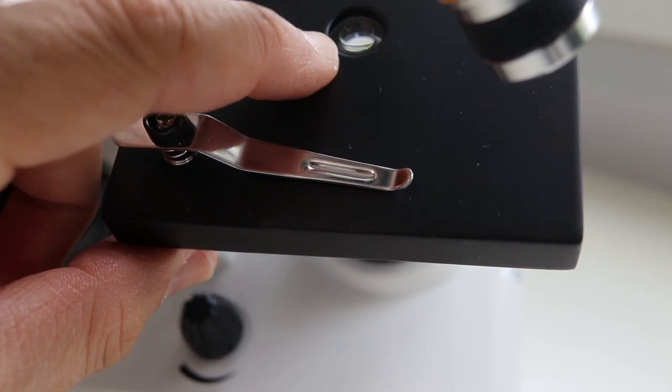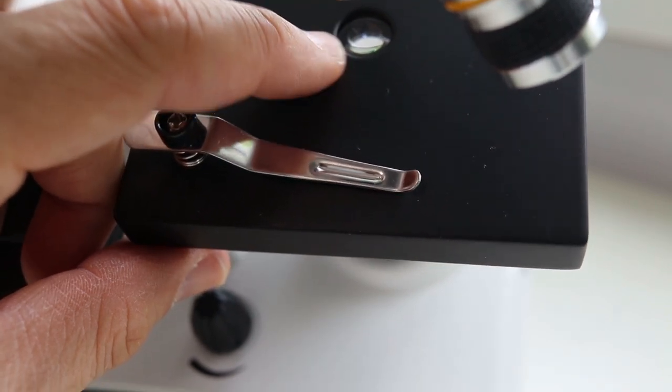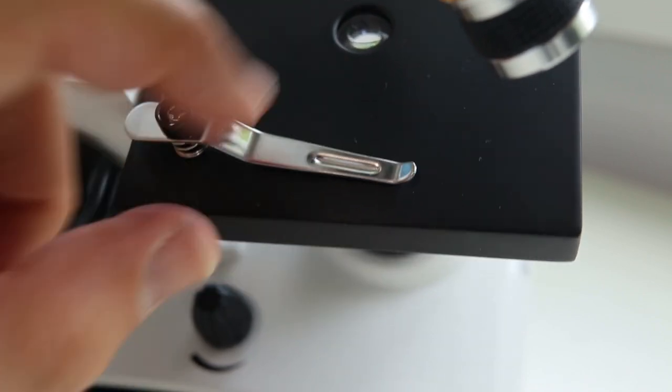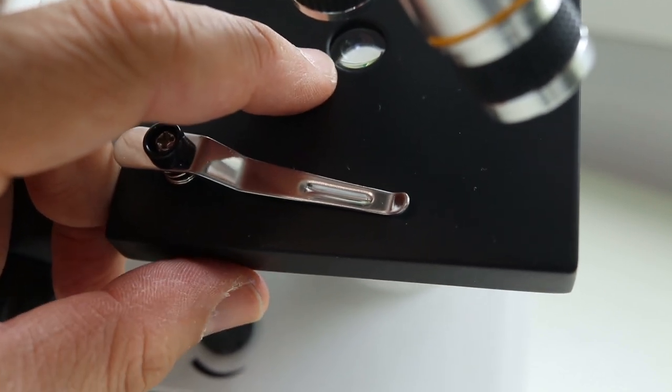The hole in the stage, there is actually a lens in here. There is a very simple condenser in here. I like this because it makes sure that the light is bundled together on the specimen. So they actually added a little optical element here as well.